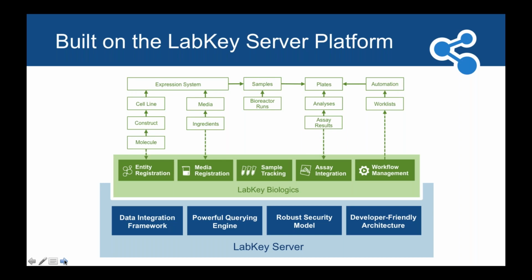Integrating all of those tracked samples with assays, and then finally that workflow management piece I previously mentioned, being able to make requests that assays be done or other sample manipulations be done. It's very configurable. In fact, you could use it to manage things such as paper preparation or whatever you want. But basically, it's a request system that is tightly integrated with the rest of LabKey Biologics.